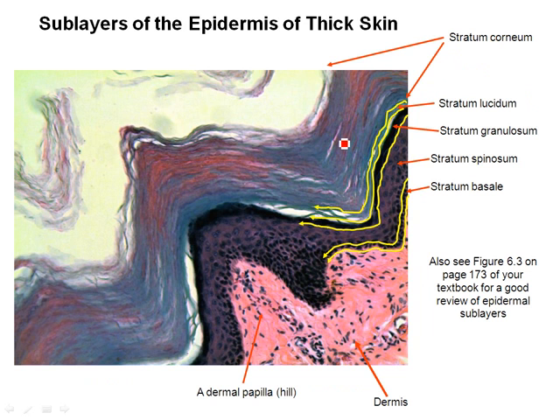All right, and last but not least, again, I just want to make sure you understand, when you talk about tissues, there's always going to be a lot of times more than one type of tissue on a slide. We're going to cover skin in my next lecture, but here's the precursor to that. This is the skin slide. From here to here, all this is epithelial tissue, stratified squamous, layers of flat squished cells, and all this is connective tissue, and this particular type of connective tissue is dense irregular. So remember, when you're looking at these slides, sometimes you're going to see more than one type of tissue. But again, when I ask the question, I'll be very specific. You'll know what I'm asking.